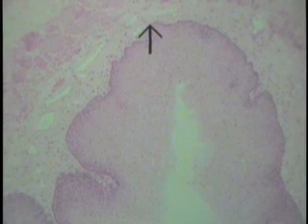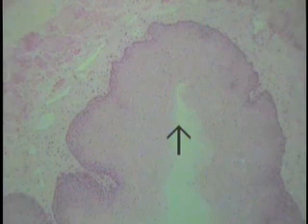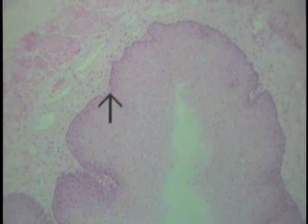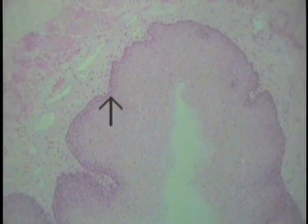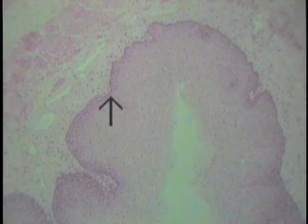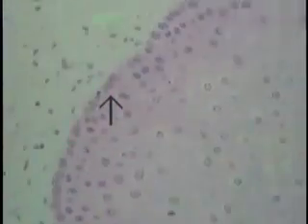to this area here, which is roughly the position of the basement membrane as seen with the scanning objective. So the epithelium in this particular case is fairly thick, extending from the lumen, where the arrow indicates, all the way to here. So you can see it's made up of a series of a number of layers of cells. Examine this type of epithelium at increased magnification. We are looking at this stratified squamous type of epithelium with an intermediate objective.